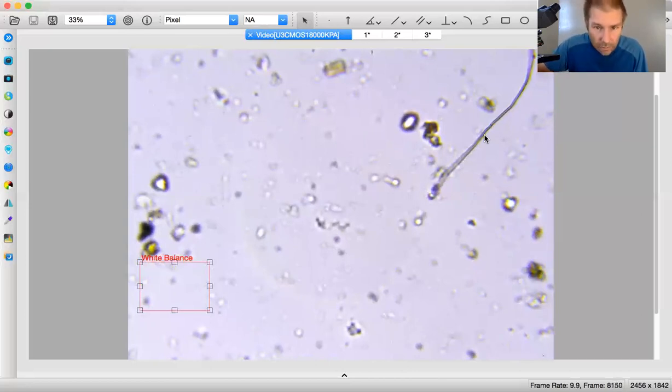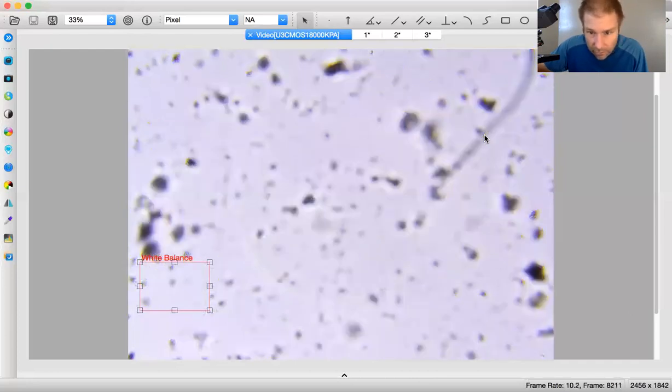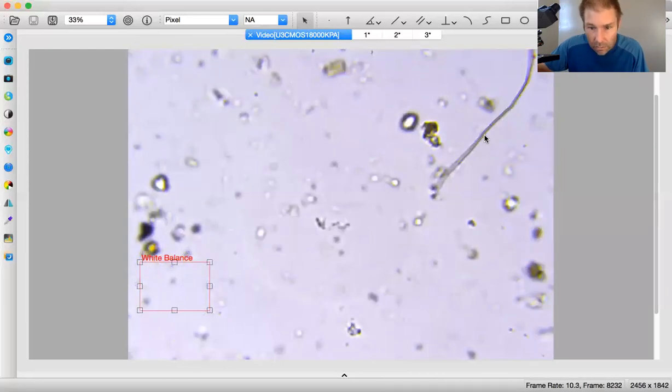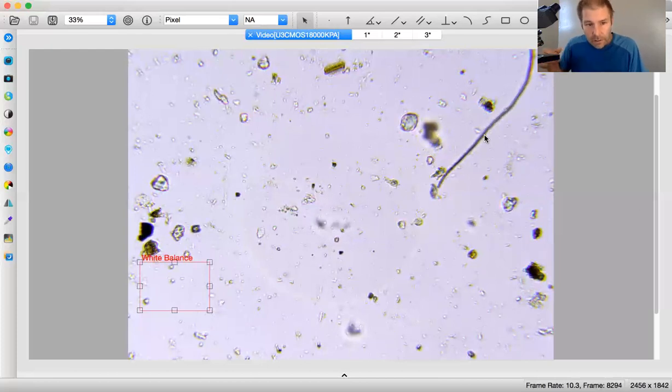As far as anything else in the frame, oh, flagellate. Can I get him in focus? Can I get it? Oh, that was moving pretty quick. It could have been a ciliate. It's hard to tell. And that was smooth motion. That was not bobbling.